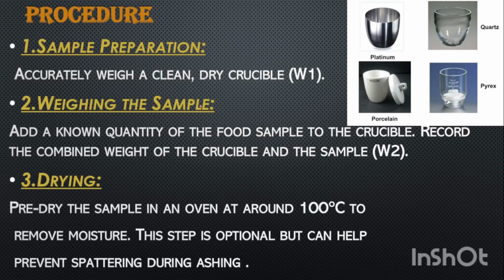What do you mean by inorganic residues? These are made up of elements or compounds that do not contain carbon. That means which do not contain carbon. It may contain nitrogen, oxygen, sulfur other than carbon.